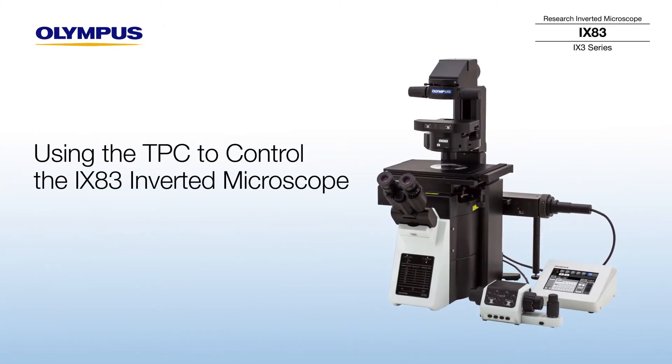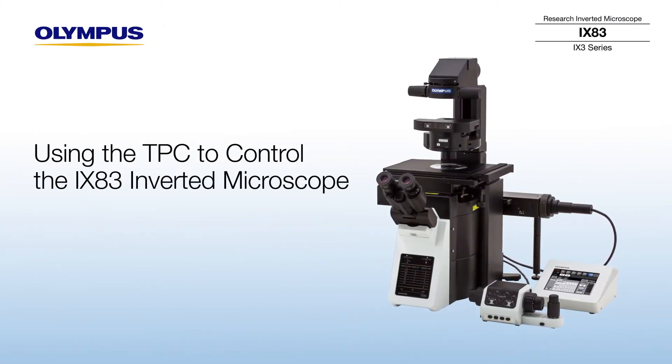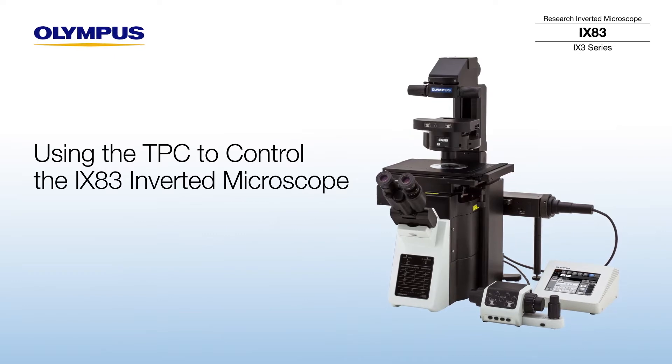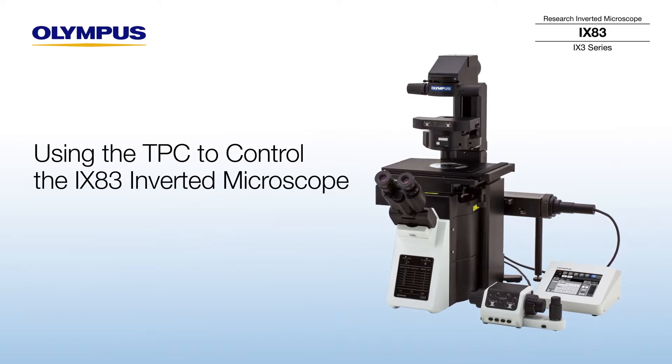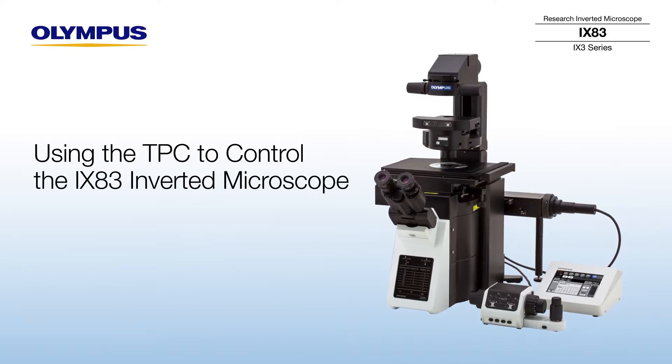This video will show you how to control the iX83 microscope using the TPC touch panel controller.